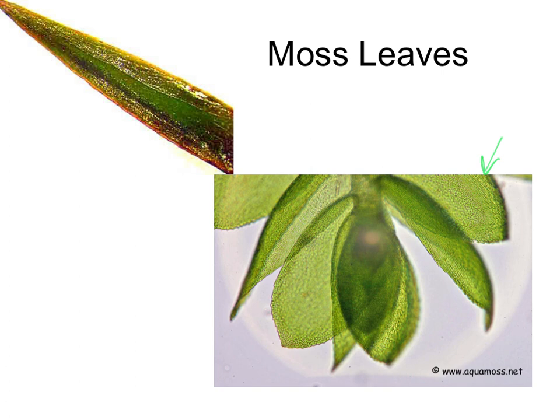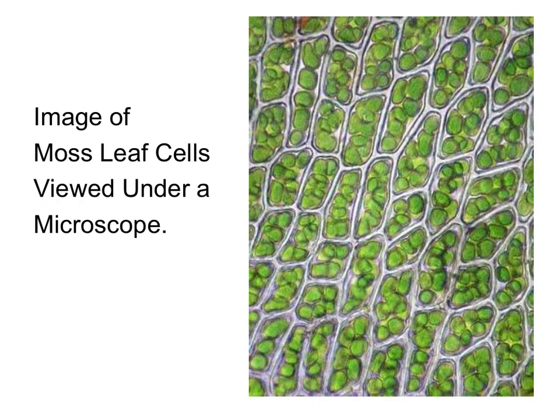If you can remember in the first video, you can go back to it if you like, I showed you a moss leaf, just a prepared slide of that. So it maybe wasn't quite as bright green because it maybe had been preserved. But we saw some of the cells of the moss leaf. But I'm going to show you another picture to show these cells in a little bit more detail. And here they are. So what do you notice that's different?